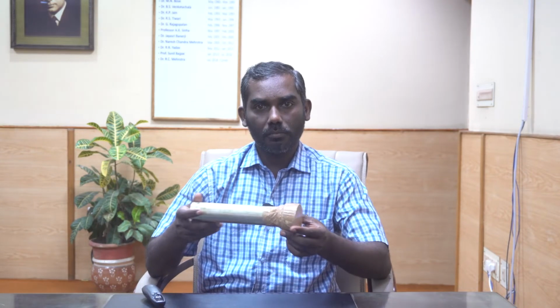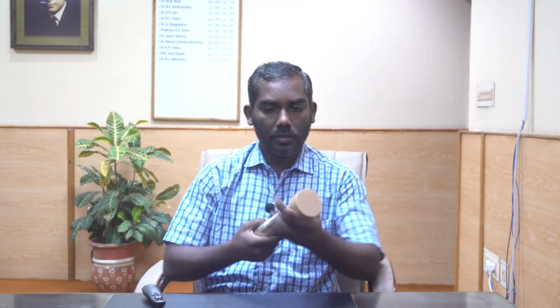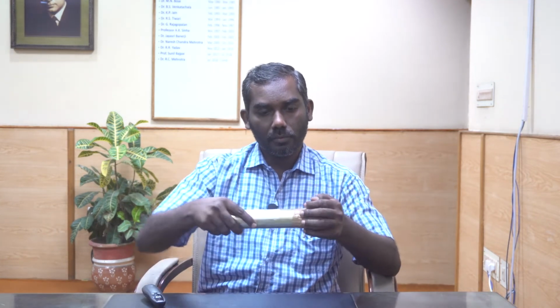Also in this principles module I would like to talk about how we collect the samples. This is a metal pipe. Actually, this already has collected samples in it. We make a trench and then we hammer the pipe inside the sediment, and then we collect the samples outside, and then we close the pipe before it is exposed to sunlight.